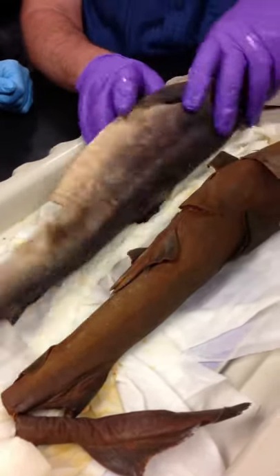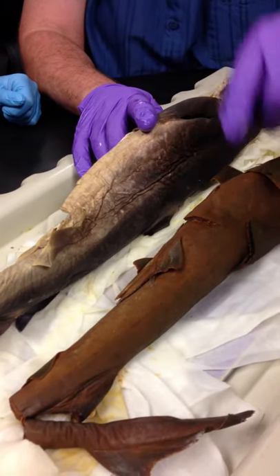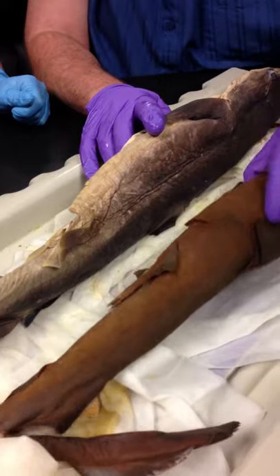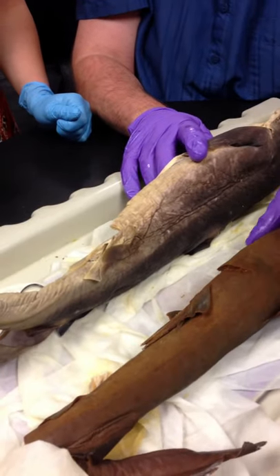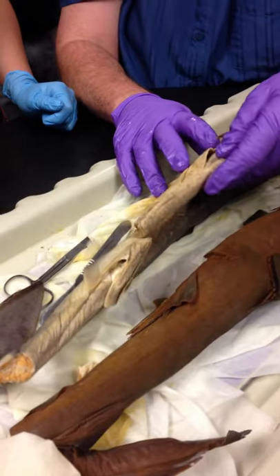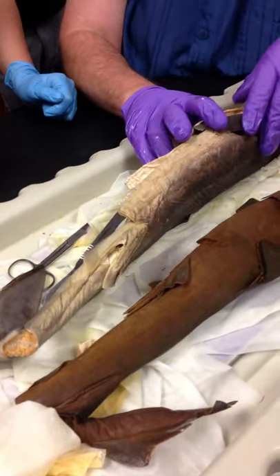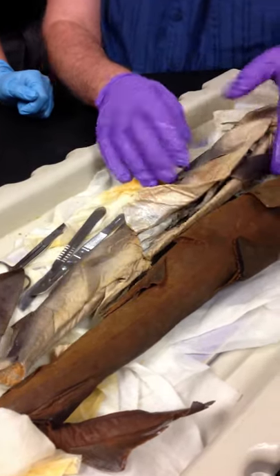Well, no, because she can get fertilized on the left and right side. So when he fertilizes her, he wants to get double barrel. Claspers. He will try to fertilize her on both sides, and she'll have a group of pups on the left side and right side at the same time. Pretty cool, right? Okay, let's do some external anatomy.